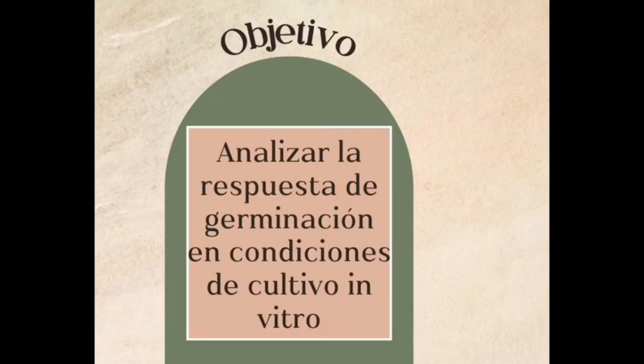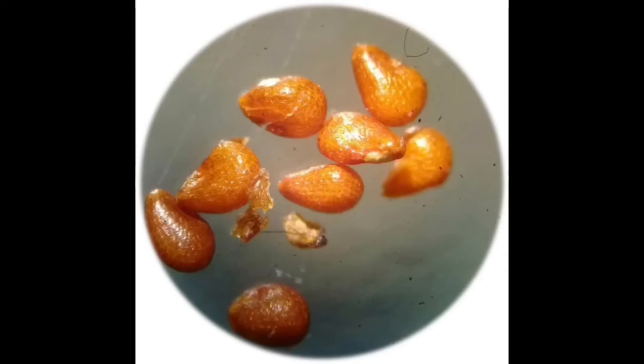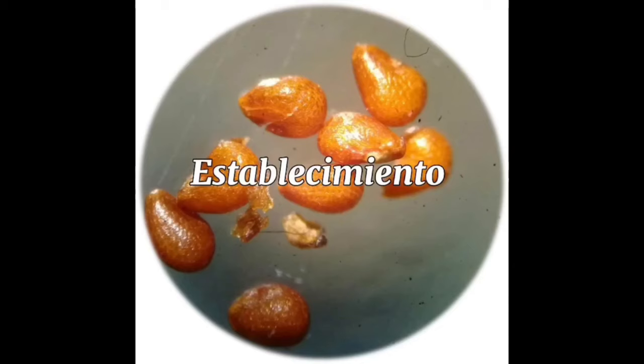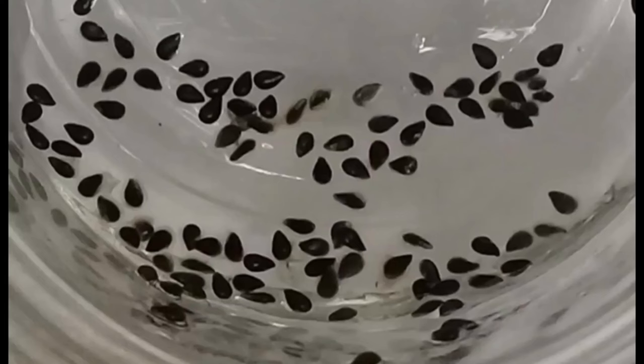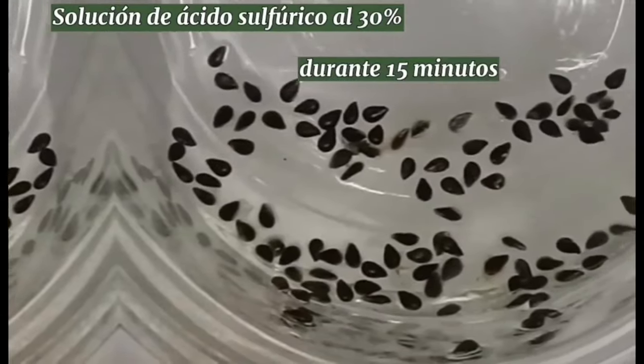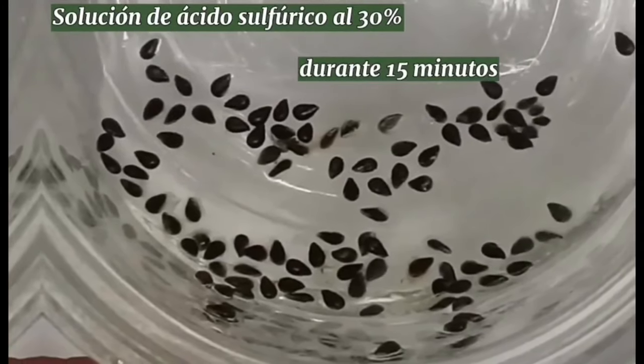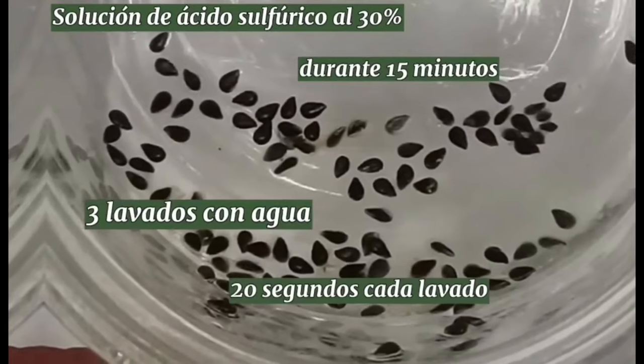El objetivo fue analizar la respuesta de germinación en condiciones de cultivo in vitro de Mammillaria decipiens y Mammillaria nivosa. Para su establecimiento se inició con la selección del explante, el cual consistió de semillas de ambas especies. Previo a la siembra fueron colocadas en una solución de ácido sulfúrico al 30% por 15 minutos. Se retiró la solución y se realizaron tres lavados con agua corriente para retirar el exceso de ácido.